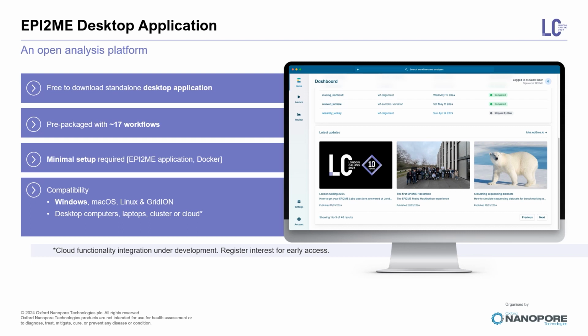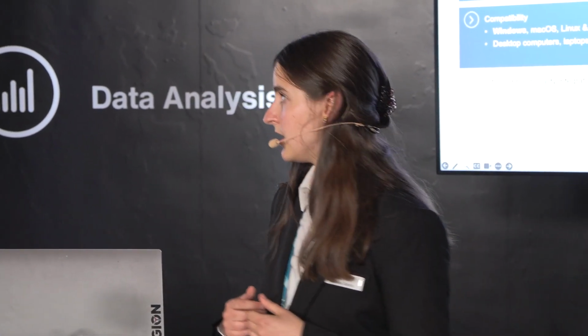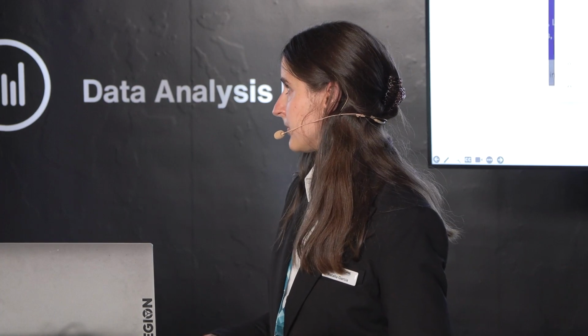So you can run the app on your laptop. You can run that in the cloud. That's now in early access, so if you are interested, please let us know during the conference. And also, as I mentioned, in the devices.